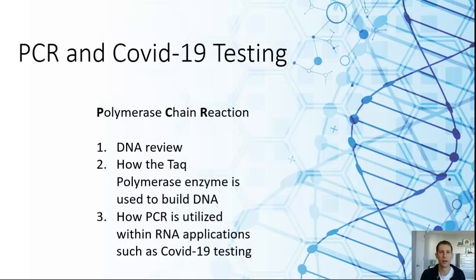Welcome to the PCR and Covid-19 testing presentation. PCR stands for Polymerase Chain Reaction. In this presentation, we're going to do a DNA review. DNA is related to the polymerase chain reaction because the chain that we're growing is a strand of DNA. We're going to discuss how Taq polymerase enzyme is used to build that DNA, and then we're going to talk about how PCR is utilized within RNA applications such as Covid-19 testing.